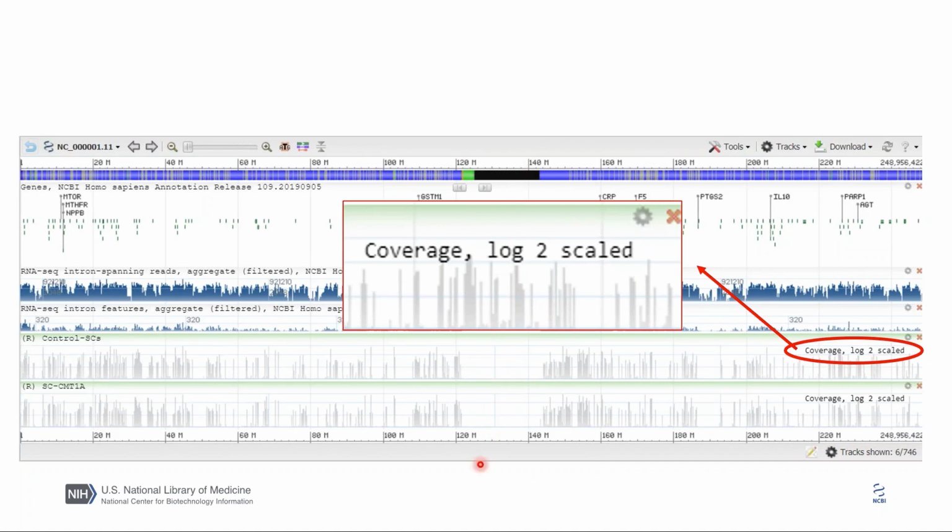So as I mentioned earlier, this kind of eyeballing can be really helpful when you're doing RNA-seq as an early step of QC, because you've run your wet lab experiments, you've got some data. And before you start delving into all the deep analyses that you might want to do computationally, this just helps you show, did everything actually work out the way I expected? Did I get good coverage across the genome? Does it look nice and even? I can zoom into various levels and just look at features. And again, it's just a nice way of checking your experiment before you invest a whole lot of time in doing your analysis. And so we're going to move on now and take a look at some of our alignment data a little bit more closely.